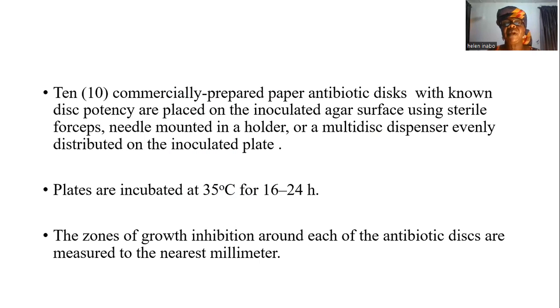Commercially prepared paper antibiotic discs or antimicrobial discs with known disc potency are placed on the inoculated agar surface using sterile forceps, needle mounted in a holder, or a multi-disc dispenser, evenly distributed on the inoculated plates. Plates are incubated at 35 degrees Celsius for 16 to 24 hours.